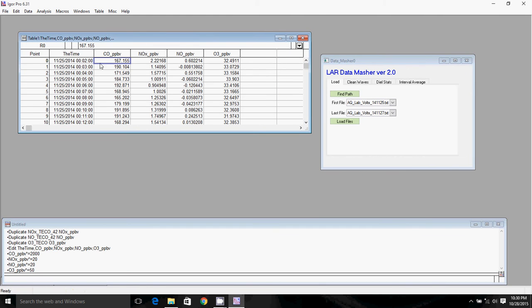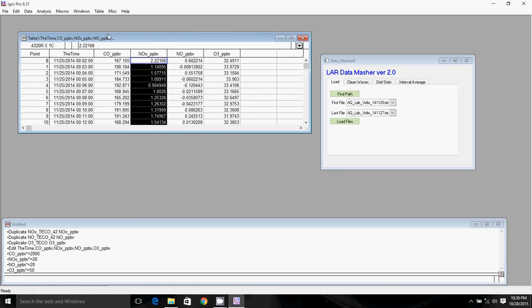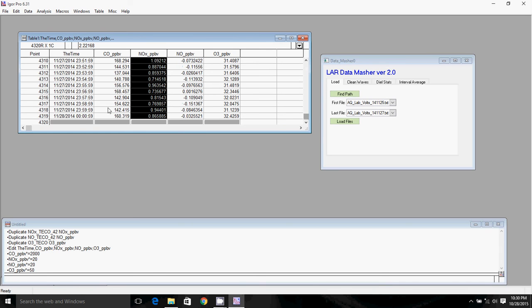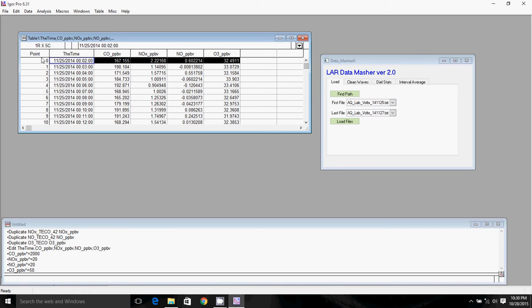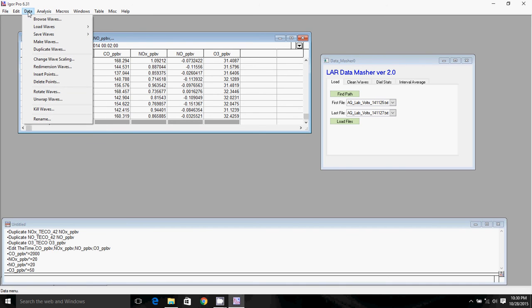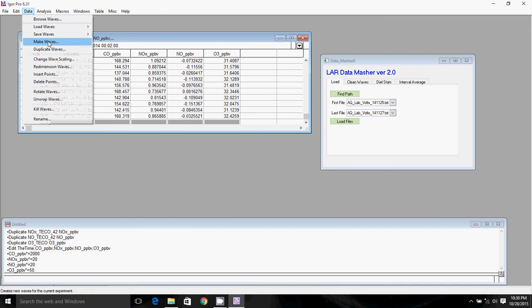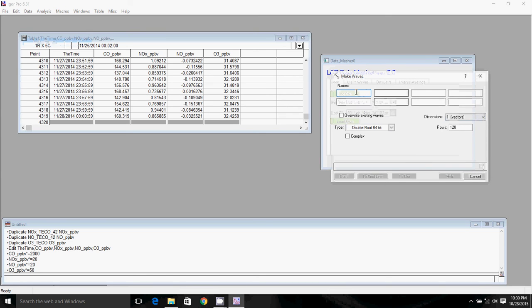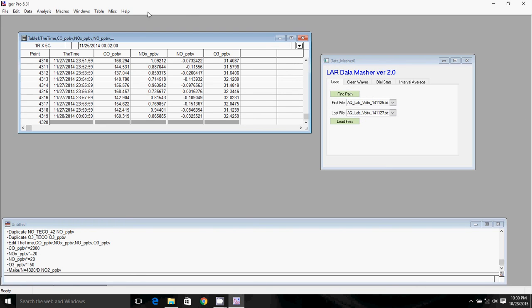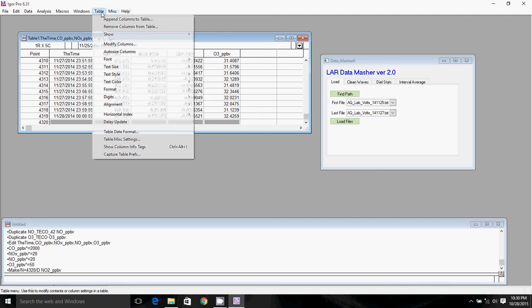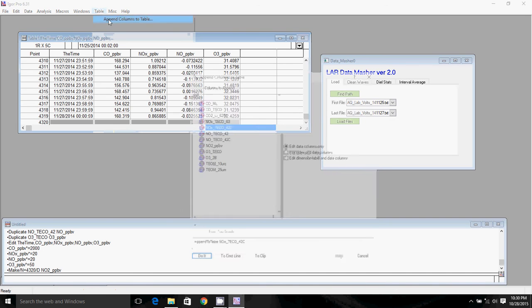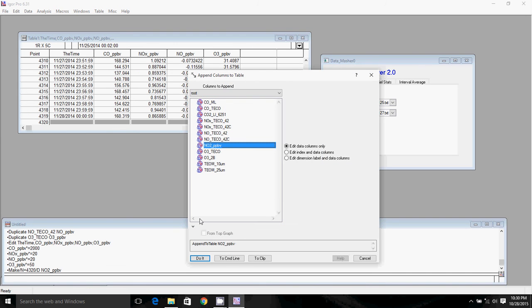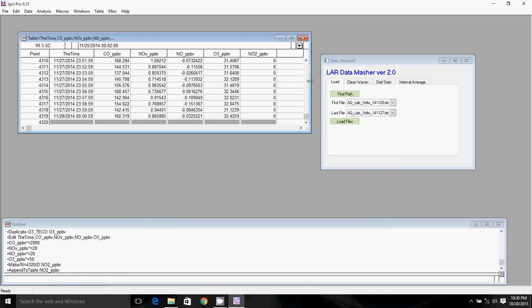What we're going to want to do now, since we have NOx and NO, but we don't have NO2, we're going to want to make a wave for NO2. So to make a wave, we want to know how many points we need in the wave. So it's going to be 4320, not 4319, because the waves start off at point zero, not point one. So to make a wave, we click on data, make waves. We want to name it, and then we need to enter the number of points. Click do it. And now we'll go ahead and just append that to the table. So we'll click table, append column to table, and NO2 parts per billion. And there it is.